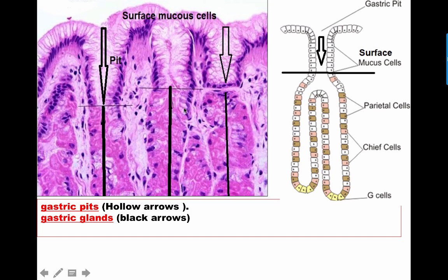When we move to the gland itself, we see other mucus cells in the neck region. These mucus neck cells are shorter than the surface mucus cells and are also full of mucus, but their nuclei are more flattened at the base. In a picture, we diagnose the pit by its narrow lumen lined by tall cells with a pale vacuolated major portion and basal oval nuclei.